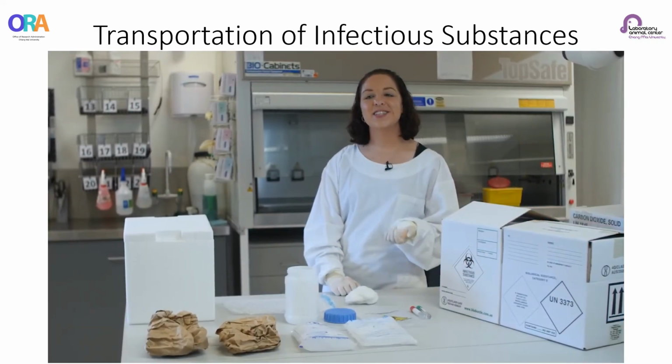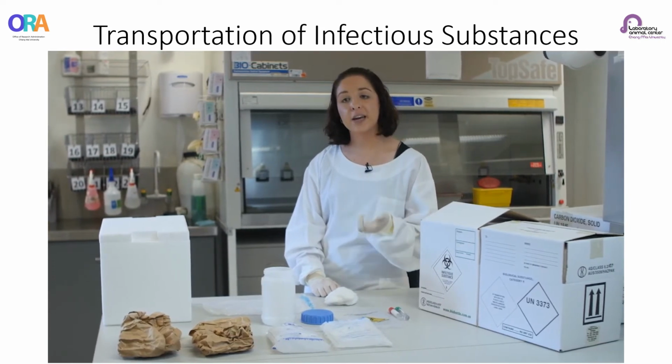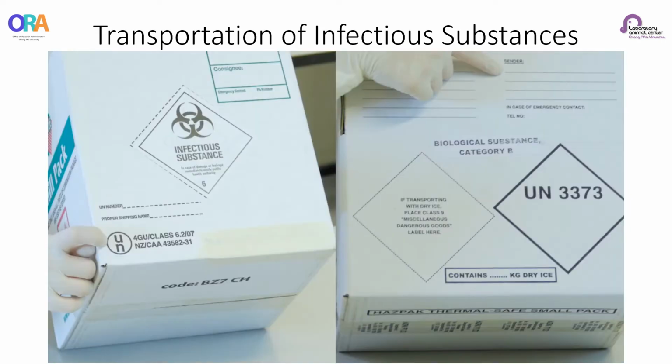The classification of your samples will determine how you package them. Today we are looking at a Category A and Category B. In the instance of an FMD exclusion request, Category A sample packaging is required when there is a high index of suspicion with clinical correlation. Category B packaging is suitable for FMD exclusion samples where there is a limited clinical correlation.